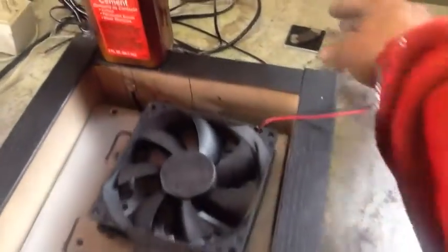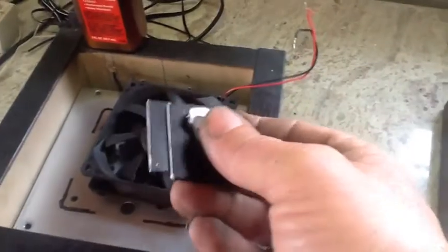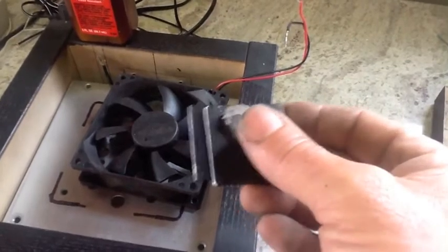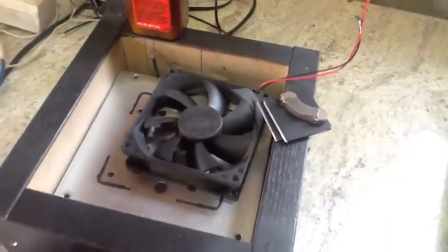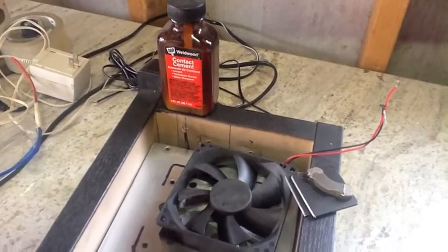I'm going to go ahead and use contact cement here and also use it on all my little plates. I do realize I'm going to lose — or gain — a little thickness, but I still have a sixteenth to play with, so I think I'm going to be just fine there. I'm going to slap this together pretty quickly with contact cement.